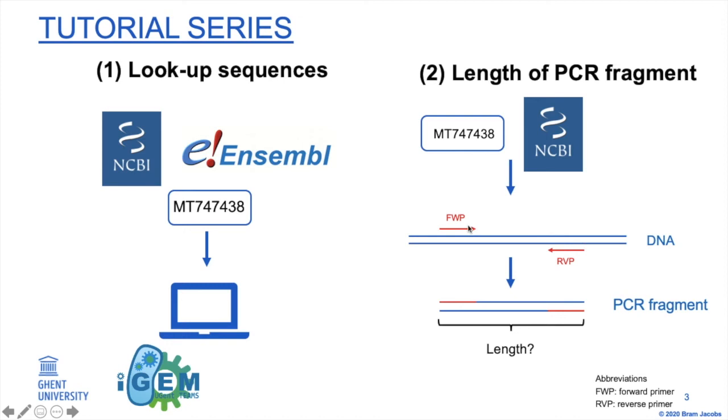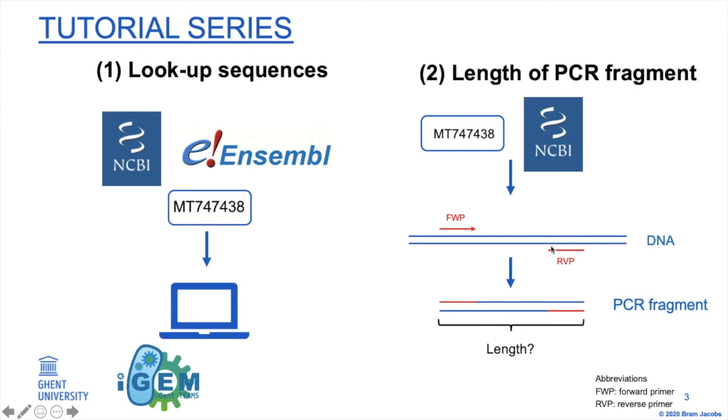And if we only want the length of the sequence between the primers, we have to do match 2 minus match, so we only have this chunk, and then we say minus the length of the reverse primer, so that we exclude this one from our calculation. And so the number that we obtain is the length, so the number of nucleotides between the primers of this region that I am now indicating with arrows.